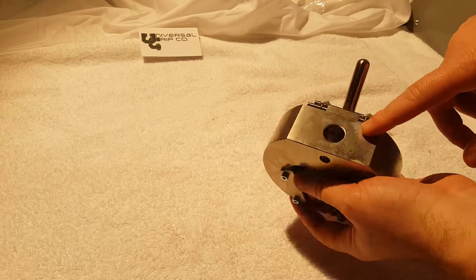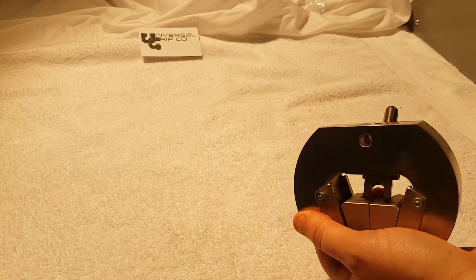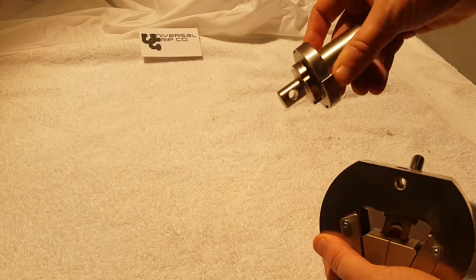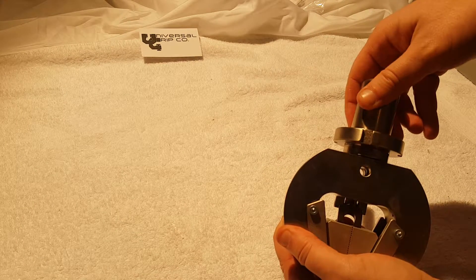It has a female 5/8 inch clevis pin coupling and uses a 5/16 locking pin. We could use an adapter, something like this, to attach this up onto the machine.